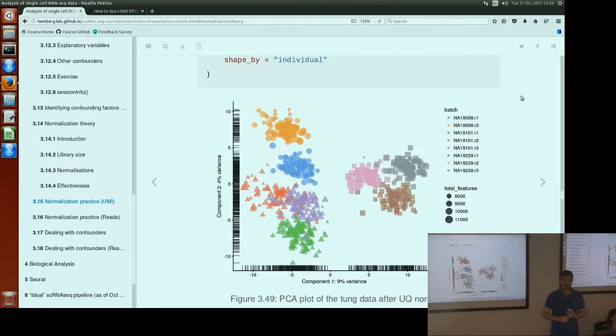So certainly at a first look at these data, yes, I would always expect to see batch differences, but I would also hope that through careful pre-processing we could minimize that effect, remove those unwanted sources of variation and focus on the biological sources of variation that we're really interested in. And so, yeah, that's our aim.